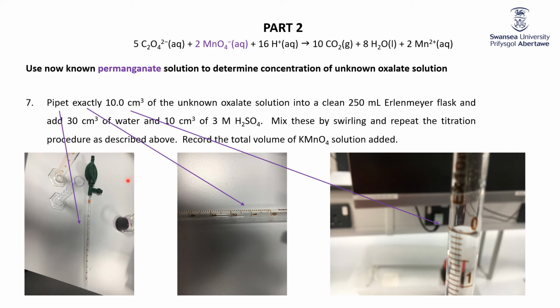Now, the idea of using a pipette at this stage versus using the graduated cylinders that I use for the other volumes is something that again features in the post-lab questions. So I want you to know exactly the context that we're talking about there. So anyway, did all this, and now let's look at the data.